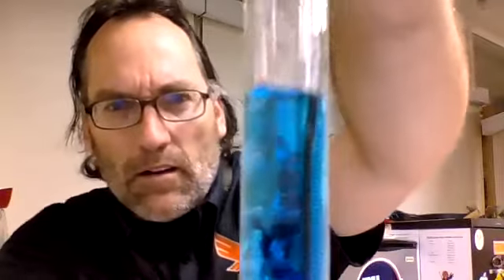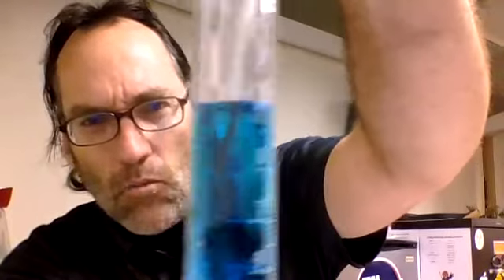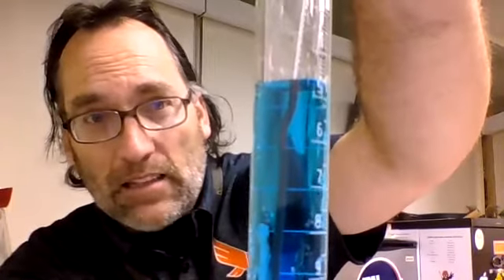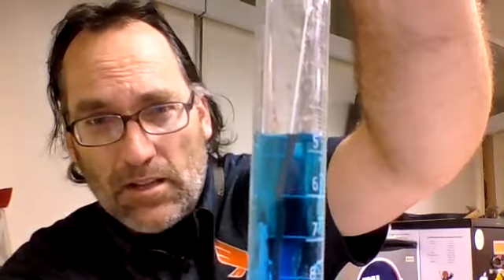Let's go ahead and I'll show you, and I don't want to take it out of the cylinder, but I want to show you the cylinder, and hopefully you can see this. Look to where the paper clip is before it enters and where it is at the 1 minute mark, which we're just hitting now. Something that I automatically see is color change. Definitely changes color from the point that it enters the graduated cylinder. So definitely color. We'll wait about another 30 seconds before we make our second observation at minute 2.